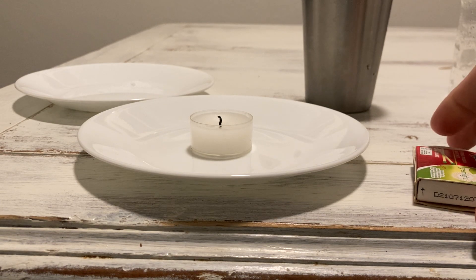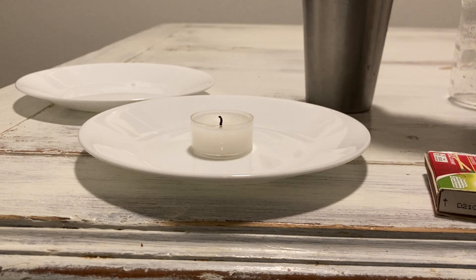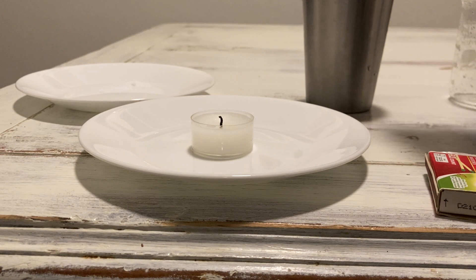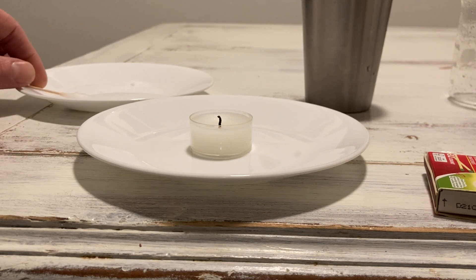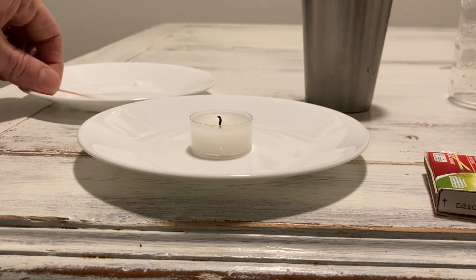Let's go ahead and get our swabs ready. We'll dip them and get them nice and wet, soaked, because we're going to put them over the candle. Let's start with regular table salt — make sure this swab is nice and soaked. Okay, so it's table salt.